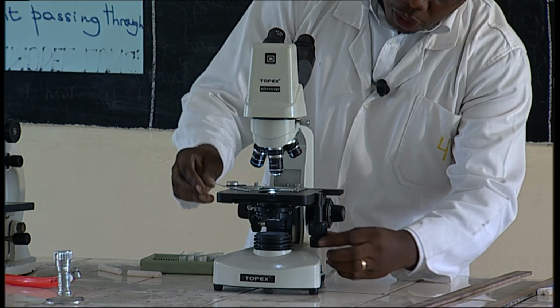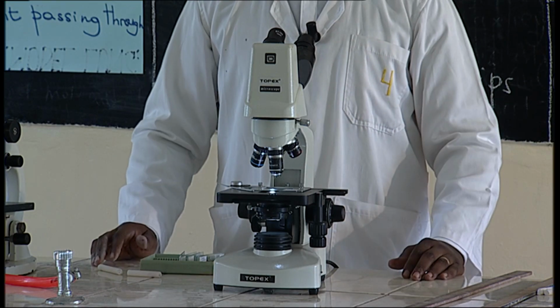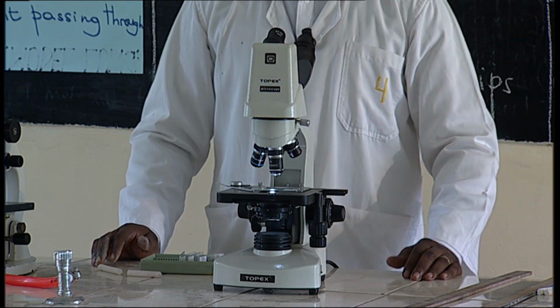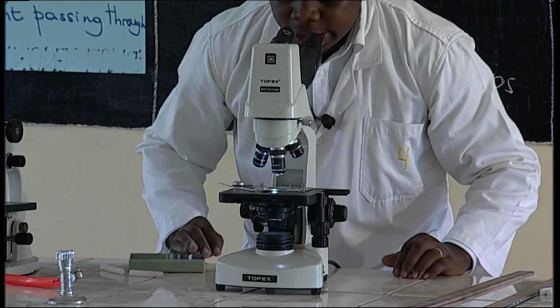And when I put it on top of the stage, it is going to be supported by stage clips. The stage clips are going to hold it in position, and then from there, I can observe nicely my specimen.